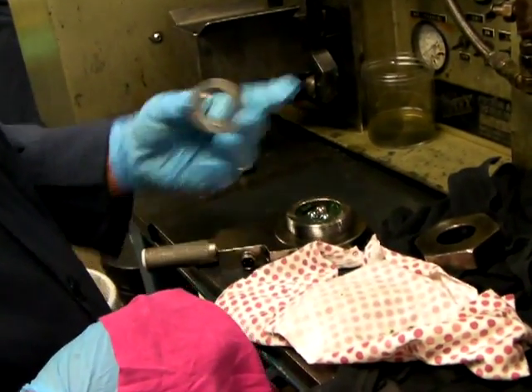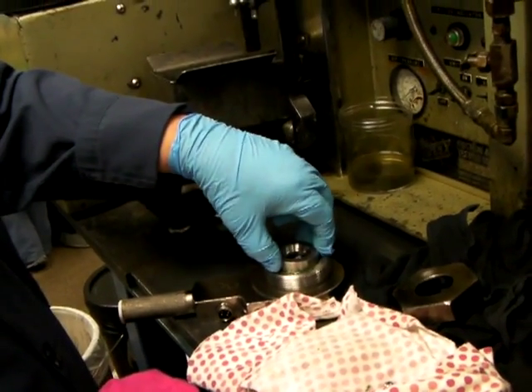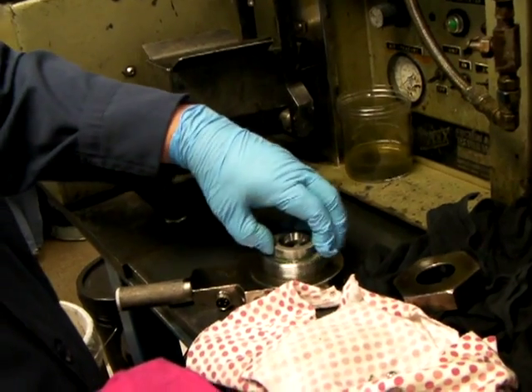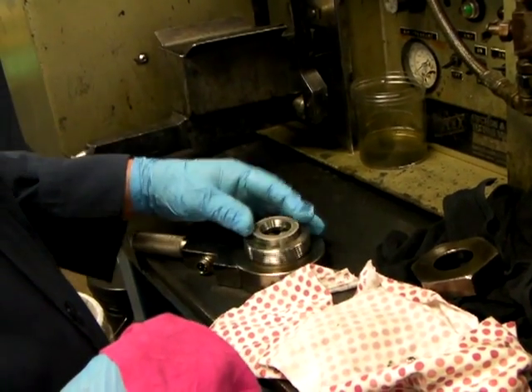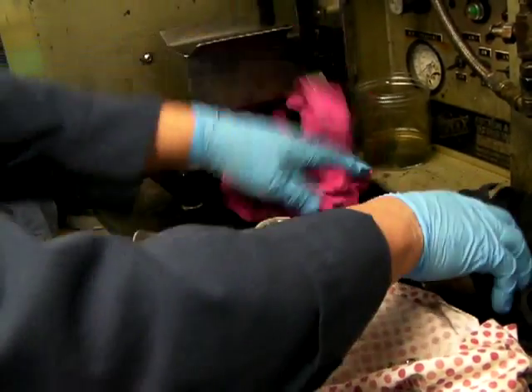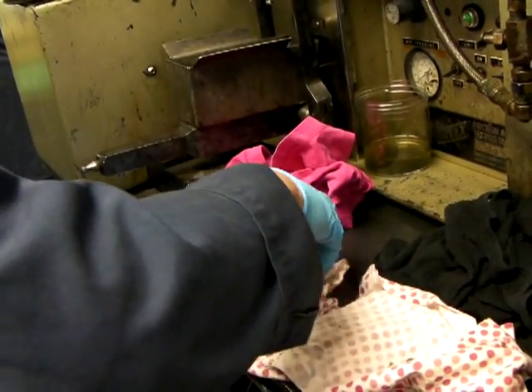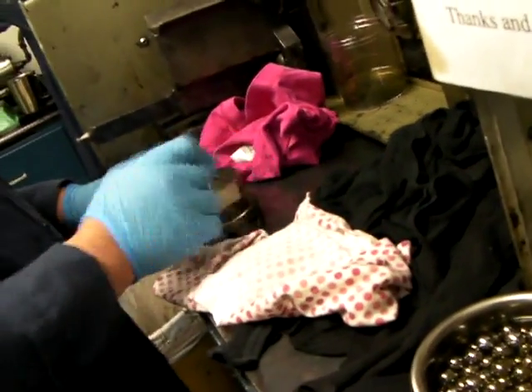Julio is setting up the four ball machine here. He's already placed the grease into the cup and the three lower balls. This ring helps secure them tightly in there. Then he screws down the nut.